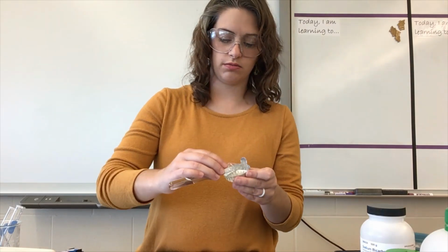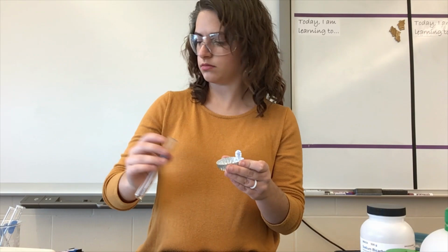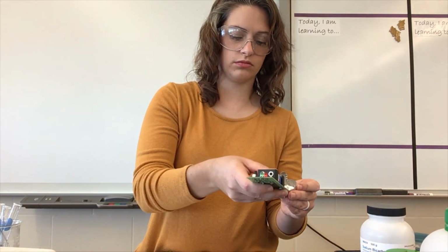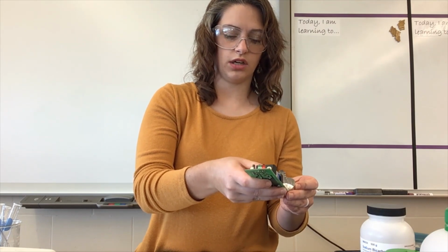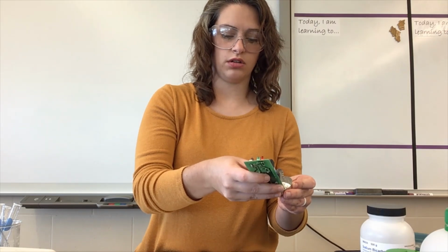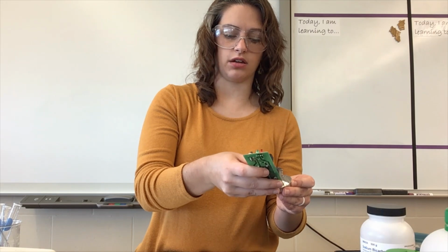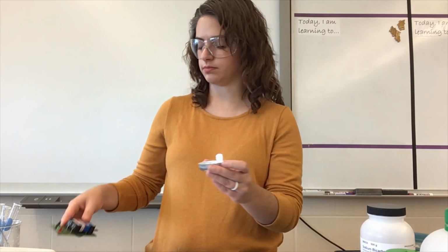So there it is. And I don't see any light with that one. So we're going to say that sucrose is not conductive as a solid or in solution. So I see no light when I put it in.